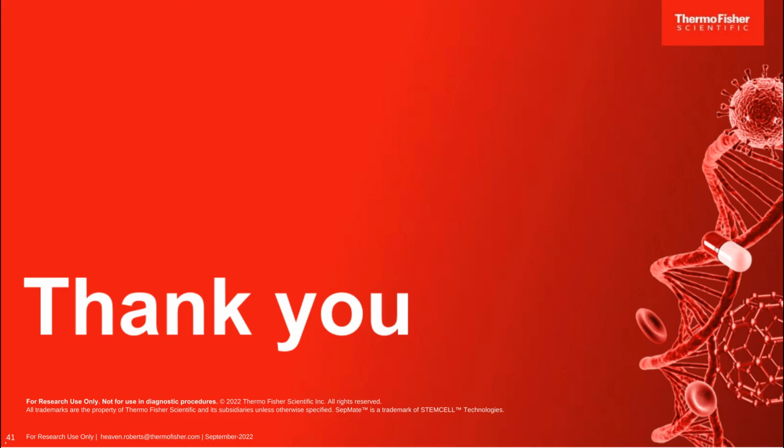Yeah, thank you. That's a good question. We can image at every flow rate, and I do not change my flow rates for images. We have some data on our website showing the same cells imaged at each flow rate. I personally get a little nervous even just running at those high rates, but I think that's personal preference. I work with a lot of different cytometers, and once you're past 200 microliters a minute, I feel like you're screaming fast.